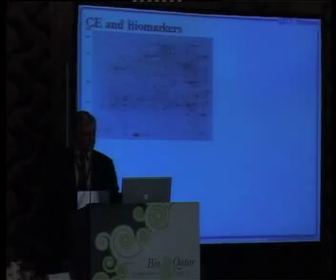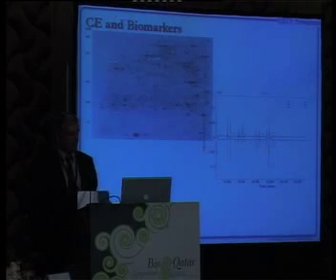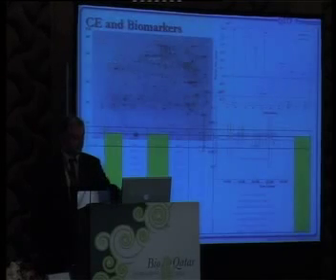Some biomarker work. This was done by Judith Nagy. This is actually work done on diabetics, upregulated proteins. This was actually a mouse, fat-fed mouse, and you can see a 2-dimensional map with the proteins, various knockout conditions on the mice being used in this analysis. You can see the upregulated proteins very clearly in this analysis with annotated results out the back end. That's what it looks like blown up.